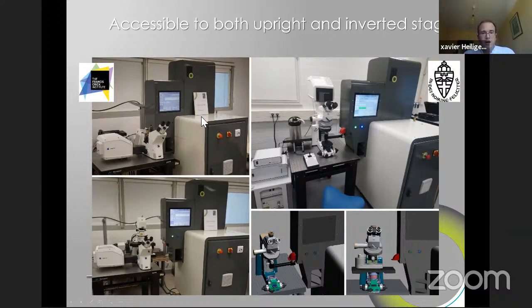So they want to avoid having an inverted arm that would expand the light path and eventually affect the imaging path, and therefore they want to have an upright microscope, and then they can retract it and put the inverter arm to put the stage and do cryo-light microscopy as the secondary imaging.